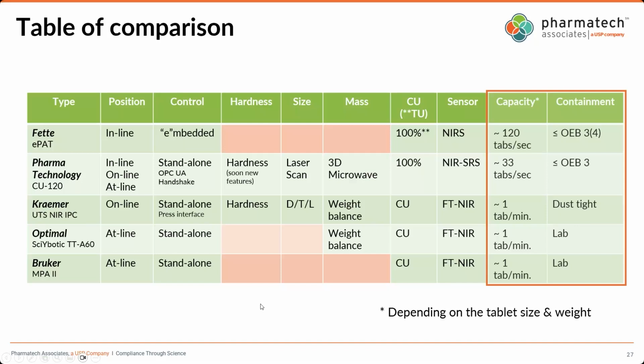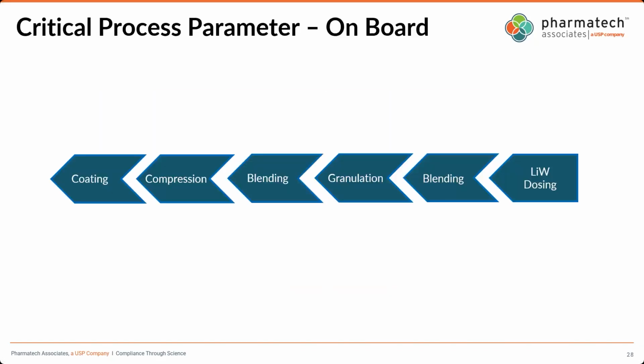Yeah, I think, Richard, one has to do a very thorough risk assessment and balance it out, with a good business case. Do we really need these technologies? There might be cases where you can justify doing 100% testing or integrating. I'm not advocating for 100%, but some of these big footprint equipment might be justifiable for certain products.